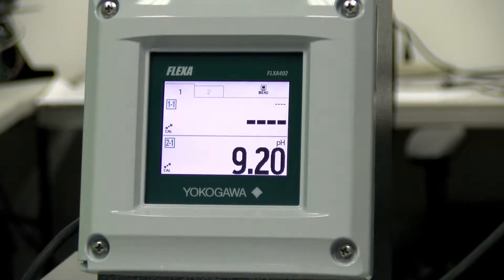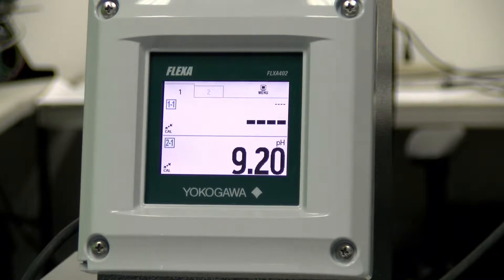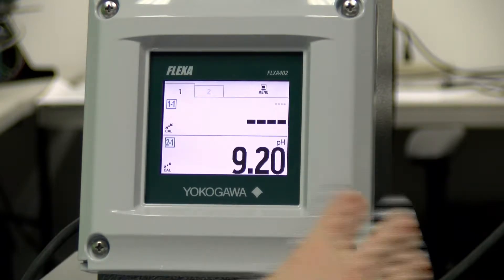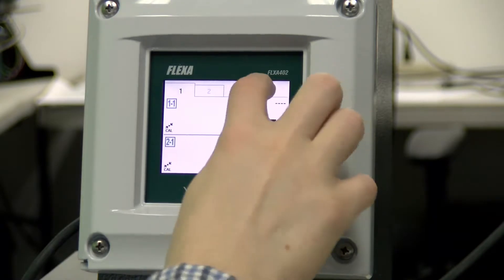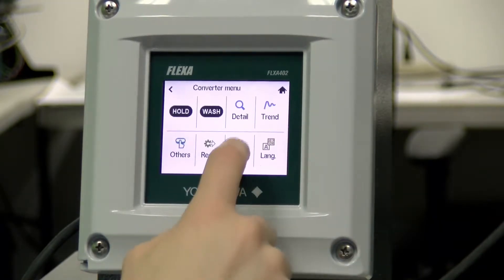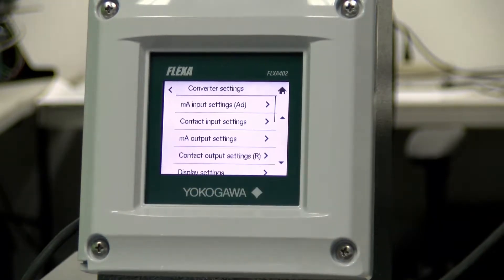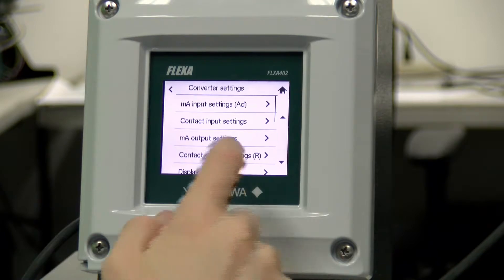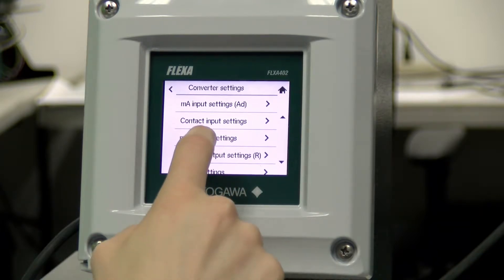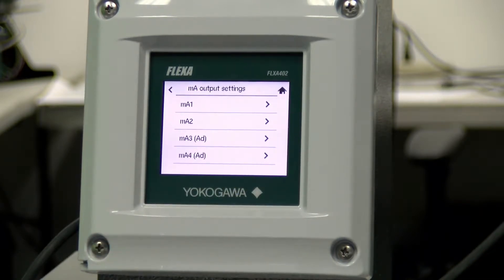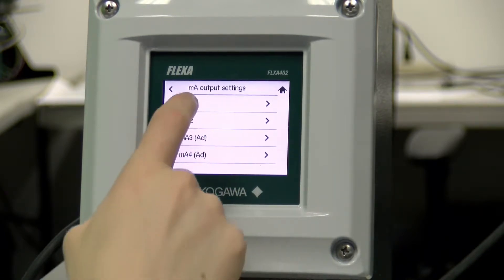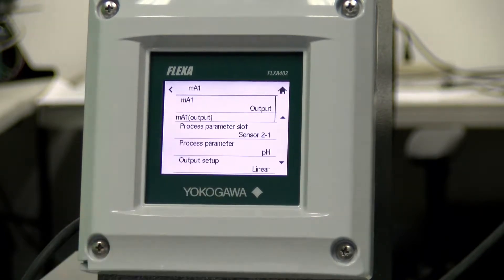Hello, my name is Tyler Yokogawa and today I'll be showing you how to set the milliamp output settings for a sensor. To start, we're going to go to Menu, then Setting, and then from here the third option, Milliamp Output Settings, then Milliamp 1 is what we're going to use in this case.